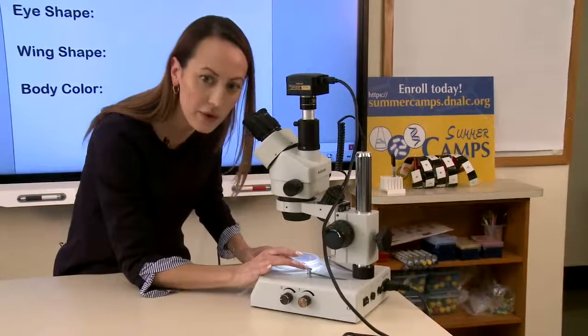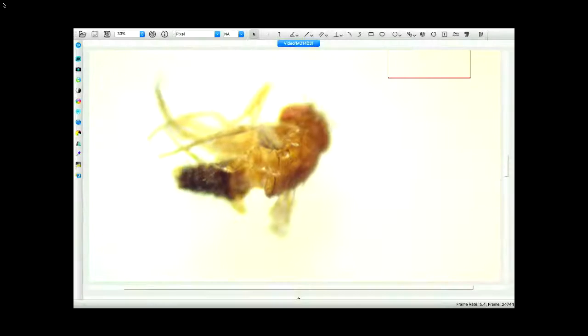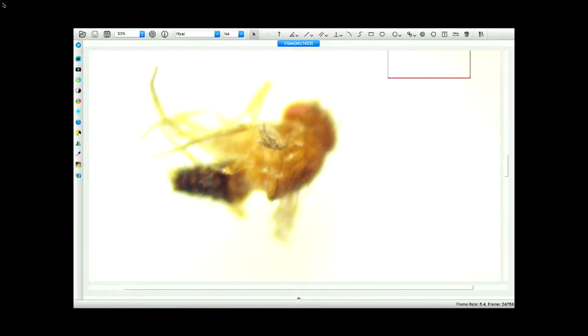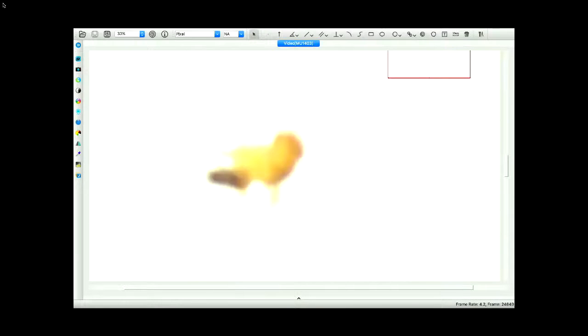Okay. All right, so we're seeing another one up close. And again, we're seeing a different wing mutation. Now this one it's not missing wings, but its wings are what we would consider crumpled. They're there, they exist, they're wings. It's just much smaller. All right, let's see what else. Let's see if we could find just a few more.